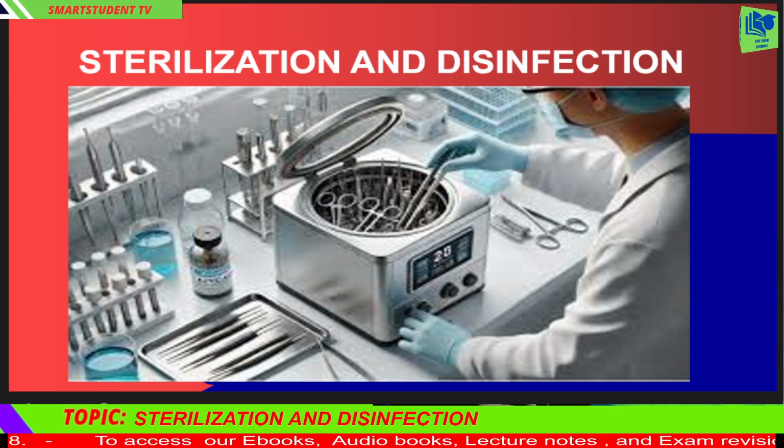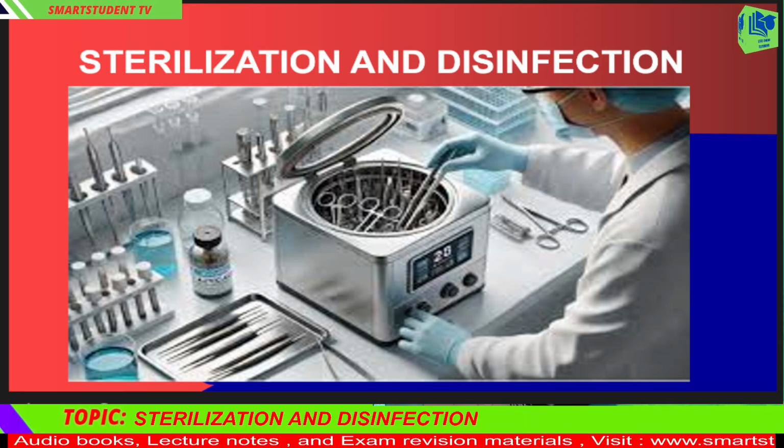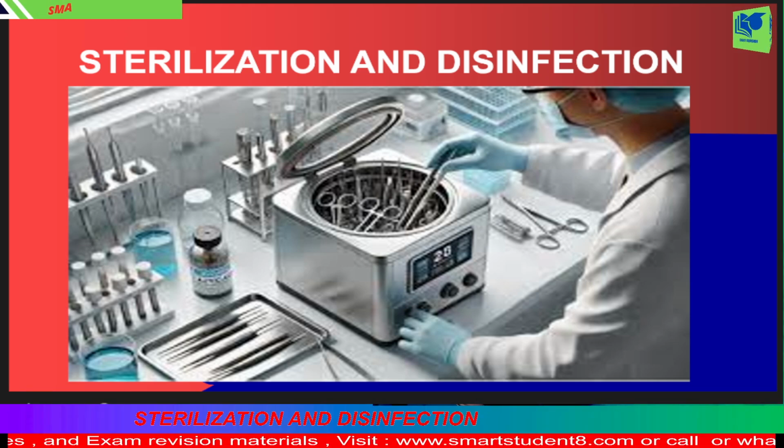In today's tutorial, we dive into another very crucial topic: sterilization and disinfection. Before we dive into today's topic, let's do a quick recap. In our last session, we explored laboratory cleanliness. Now, let me ask you a question. Why do you think a clean lab is essential?